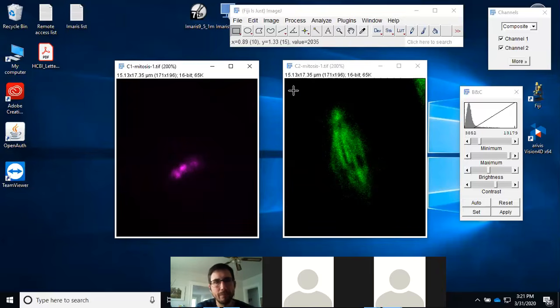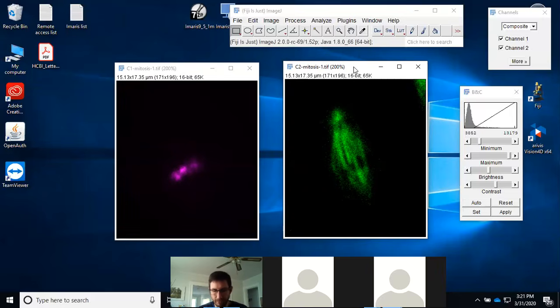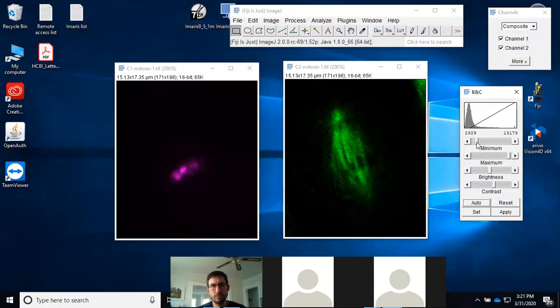Now, what I kind of want to do just for the rest of the time here is show you a processing pipeline. So in my opinion, any type of image processing has 3 steps. First step is filtering, second step is segmenting, and the third step is analysis. And so the filtering that you do up front is just to clean up your image and make it a little bit easier to do your segmenting on. So I'm going to show you a couple filtering tricks on this image, and then we're going to do some segmenting and analysis on a different image.